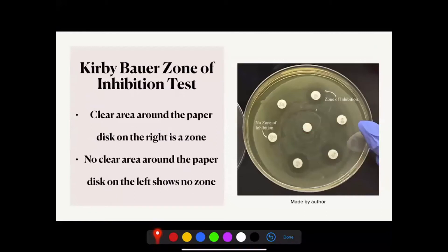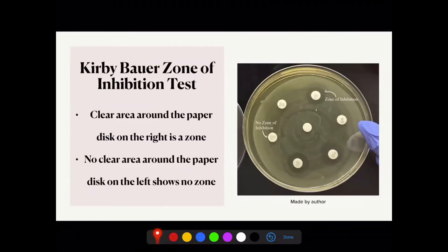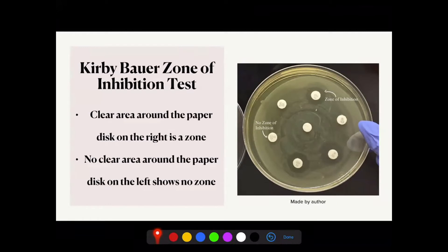The Kirby-Bauer disc diffusion susceptibility test was used to determine the resistance of aerobic and anaerobic bacteria to antimicrobial compounds. The sample was first plated on agar, and antimicrobial filter paper discs were distributed evenly across the surface. The presence or absence of growth around the paper disc indicated susceptibility — also called the zone of inhibition. In my experiment, I tested endodontic irrigant and antibiotic paper discs. Since there is no clear area around the paper disc on the left, there is no zone, while the clear area around the disc on the right is a zone.